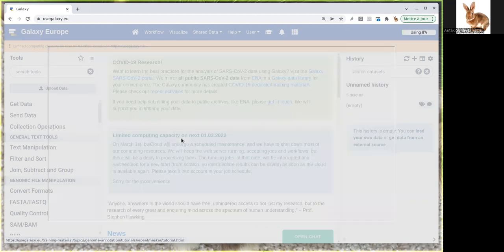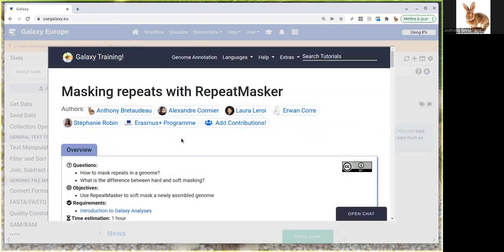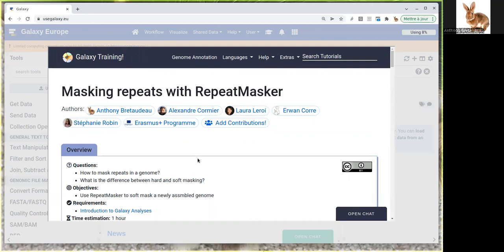There are multiple programs available to perform repeat masking. Today we're going to use RepeatMasker. There are other ones like RepeatModeler or Repet, and these software use different strategies.